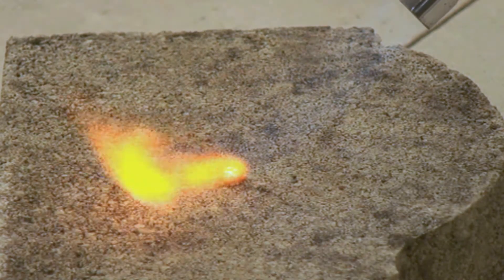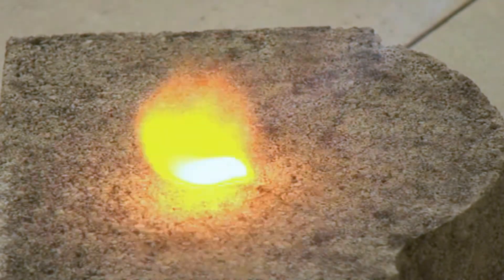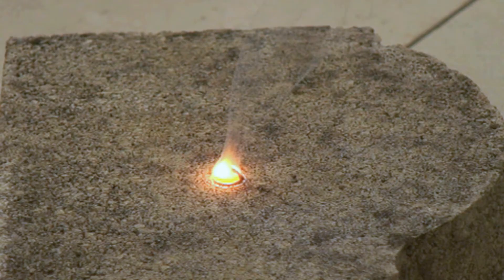Soon you see the metal begin to melt. The melting point of sodium is only 97 degrees Celsius, and sparks of flame appear, but it takes several more seconds before the fire catches hold properly and the blob of sodium burns on its own with its characteristic bright orange flame.